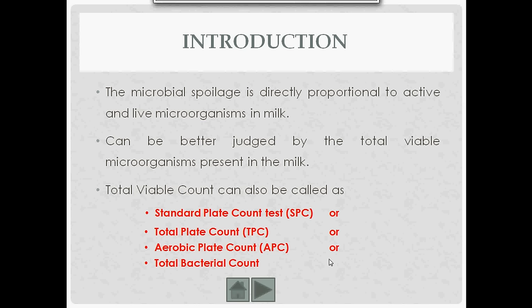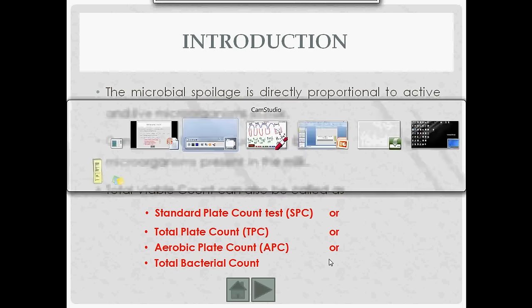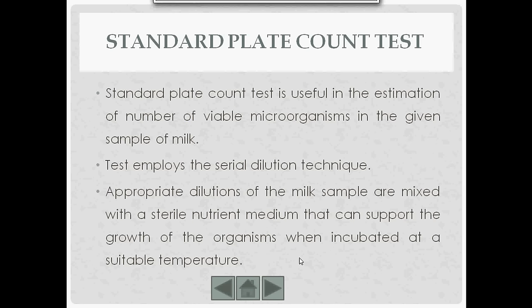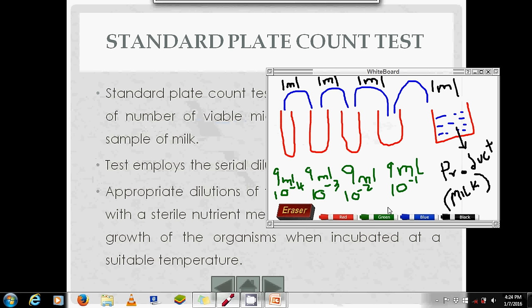This technique is otherwise called standard plate count test, total plate count test, aerobic plate count test, or total bacterial count. This test employs a serial dilution technique. The serial dilution technique can be explained using this small picture.